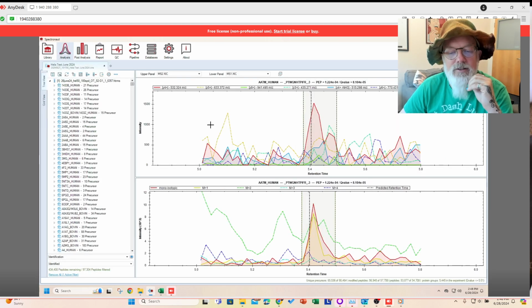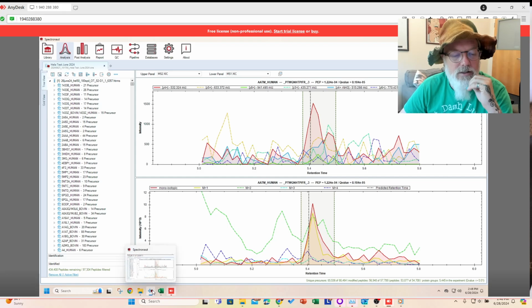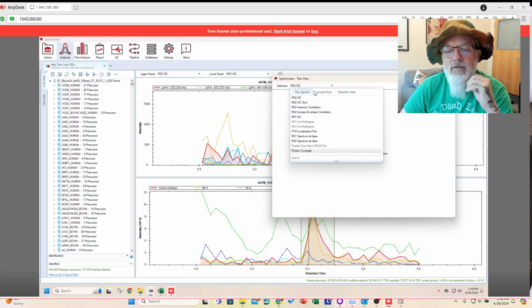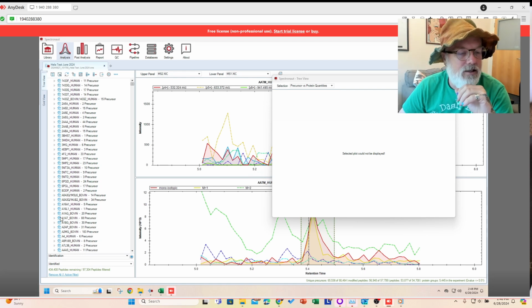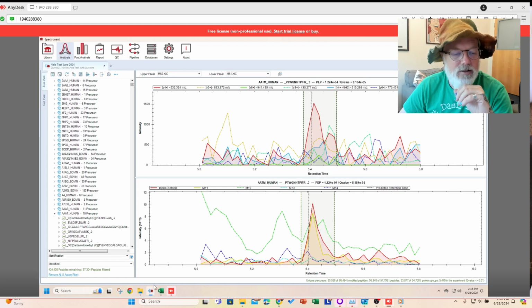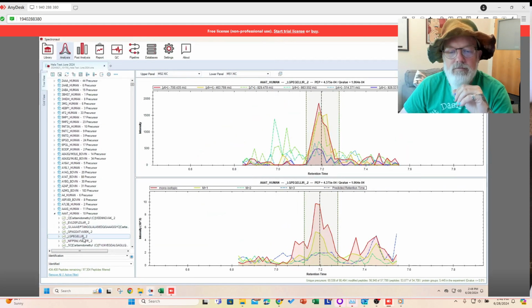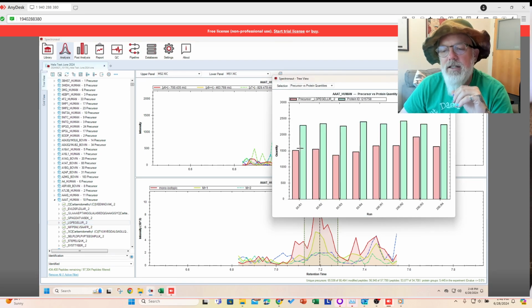Okay, then we'll go back and we'll just select some precursors again. Third window, go back, cross runs. And by the way, this precursor versus protein quantity seems to be a new feature in 19, which I do really like. Ooh, that looks nice. Okay, kind of a janky signal, but we'll see. All right, that looks okay. It gets a little more up in the 200.